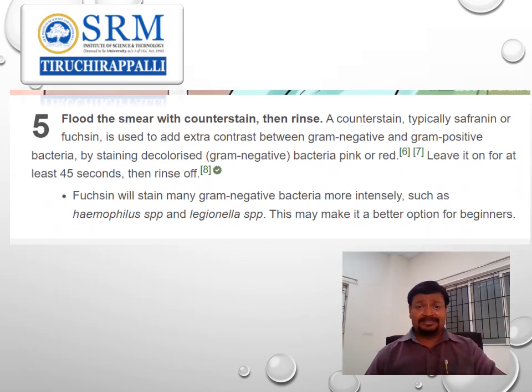Then flood the smear with the counterstain, then rinse. The counterstain is typically safranin or fuchsin, with safranin commonly used. It adds a red color to give extra contrast between the gram negative and gram positive bacteria. After decolorization, gram negative bacteria are stained pink or red. Leave it on for at least 45 seconds, then rinse off.